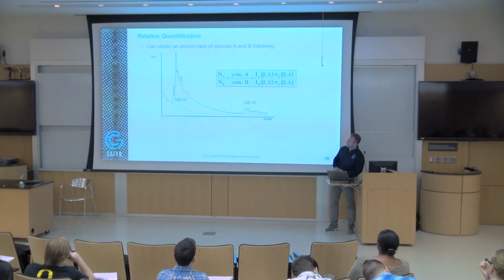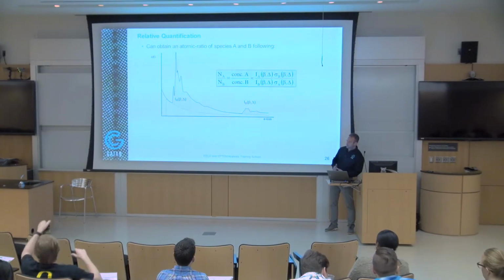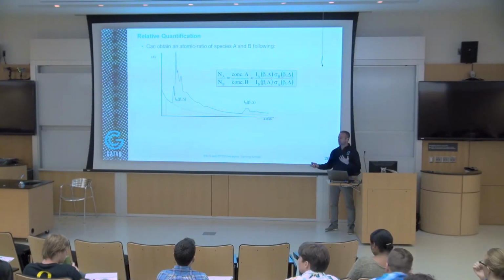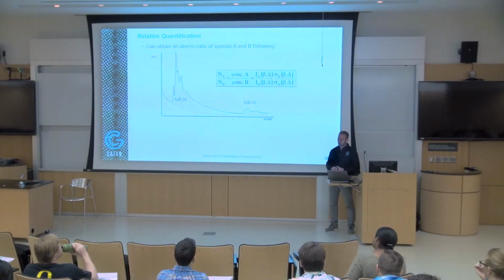Now, if you use a standard, you have to make sure that your data is always acquired in the same way, so you don't change anything in your microscope conditions. You're working with the same accelerating voltage, and the thickness is within a certain range. You also want to use the same background window and the same integration window. Everything has to be exactly the same.